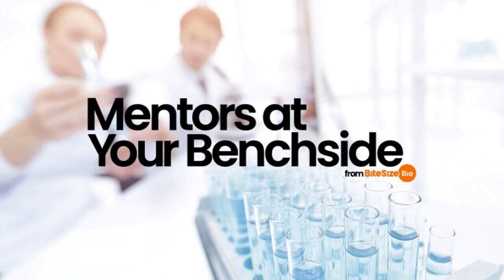As we can see, confocal laser scanning microscopy is a complicated technology with a lot going on underneath the surface. Many different processes are happening quickly to give you the image that you see on your screens. But now we know how samples are induced to fluoresce using laser light, how 3D images are built from 2D micrographs, and the componentry that makes it all happen. So that's it for confocal laser scanning microscopy.